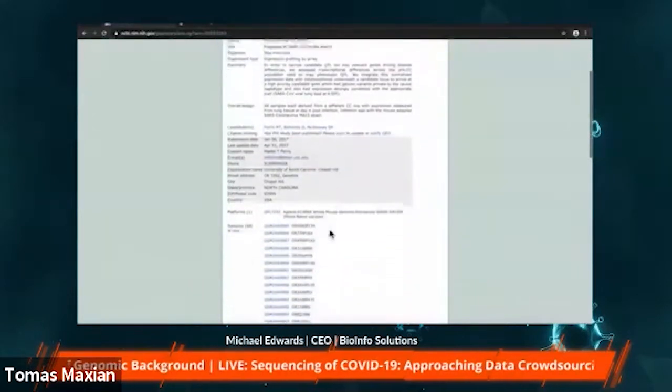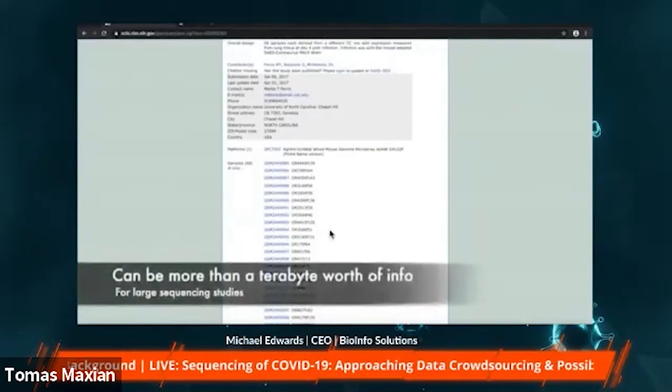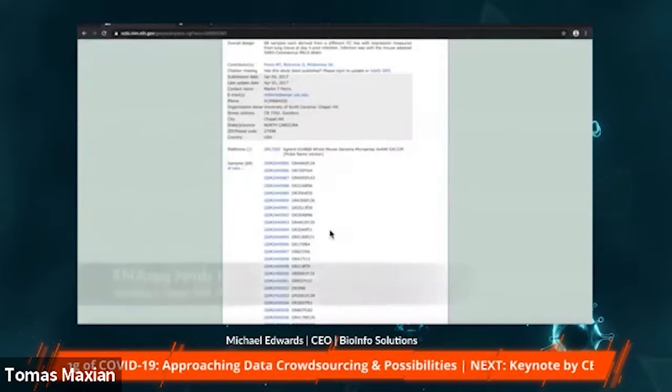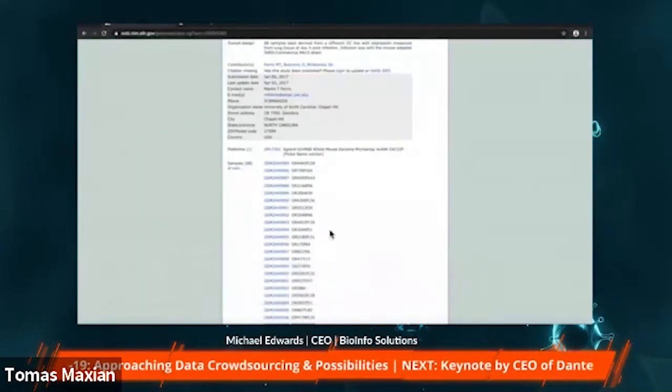Downloading all the studies you plan to use can take a considerable amount of time and memory, and you would still need to analyze them yourself and devise a way to combine all of these data, given that many of them were done with different technologies with different sensitivity. This is not an easy process, but it can be done. I decided to take an easier route by choosing a data repository where they already have downloaded and analyzed these data for you.